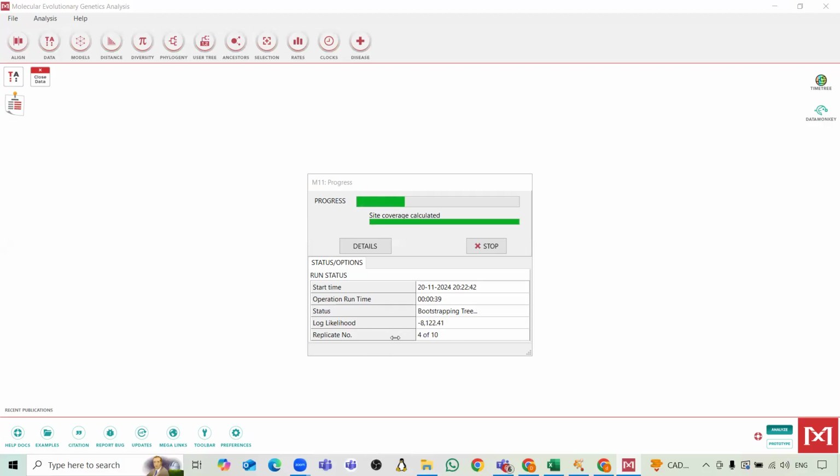Am I audible? Yeah, you are. Okay, but can you just repeat your sentence? One minute. On the downside, replicate 5 out of 10 is done, 6 out of 10 is done. So it is completing the process now. Okay, can you just repeat your last line?